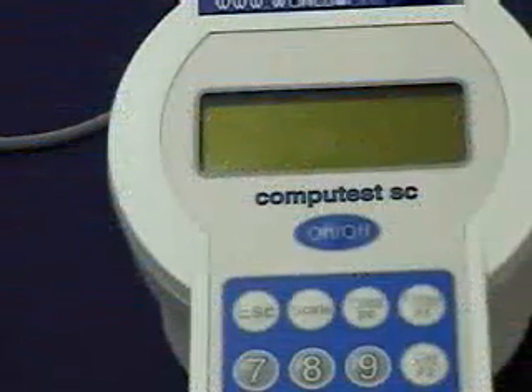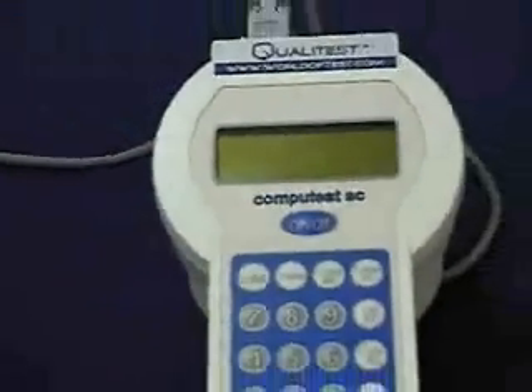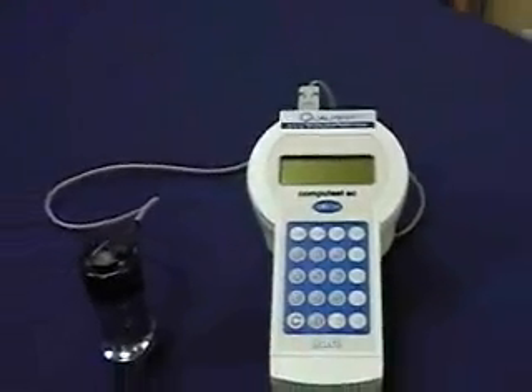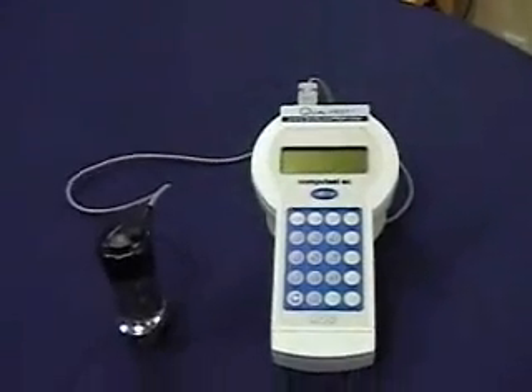to one point, while it can convert to other scales as well. The CompuTest also complies with the ASTM B724 standard test method for indentation hardness of aluminum alloys.